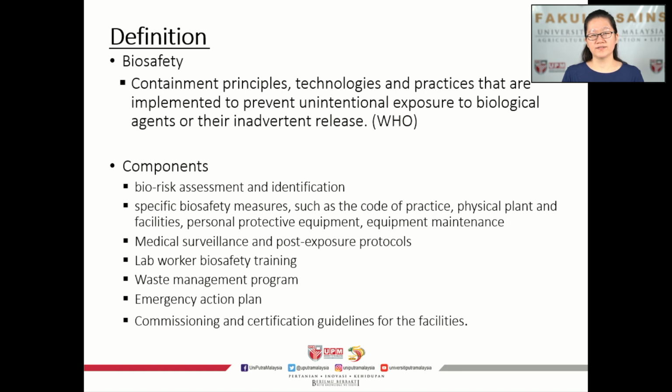So what is biosafety? Biosafety basically refers to the containment principles, technology, and practices that are implemented to prevent unintentional exposures to biological agents and their inadvertent release, according to WHO.